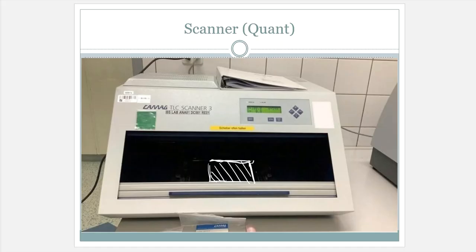So what you'll see is that this thing kind of moves back and forth and up and down, and then you'll hear it go boop, boop, boop. That's what it does. So there's my sound effect, my new one for the day. And then as it's doing that, it's gradually working itself up the plate, and then it's going from left to right on the plate as well.